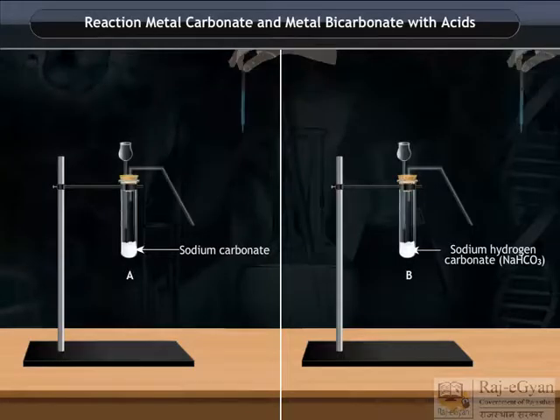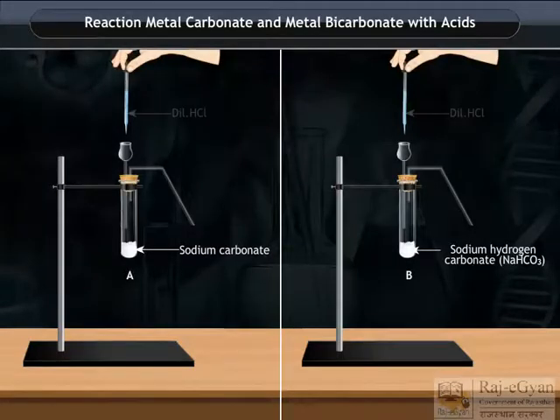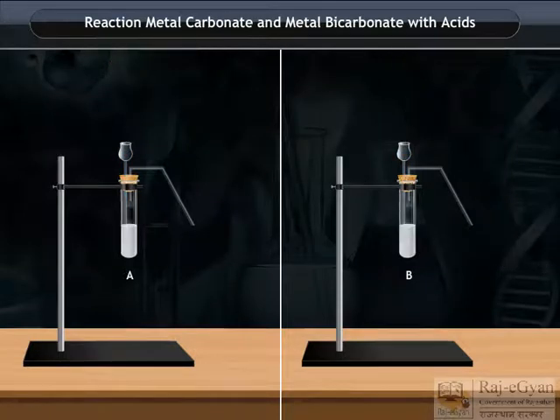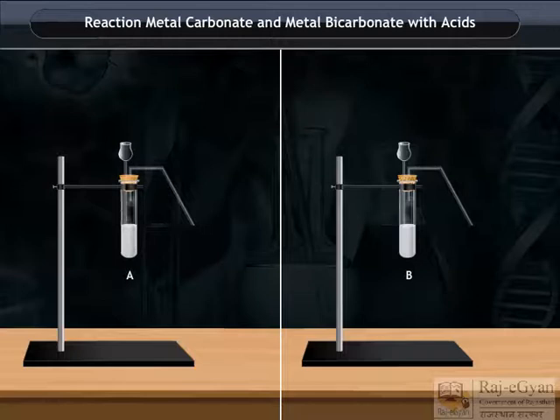Add about 2 milliliter of dilute hydrochloric acid to both the test tubes. You will observe that the gas is evolved with brisk effervescence.